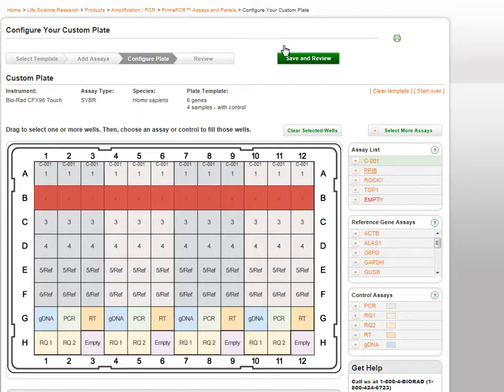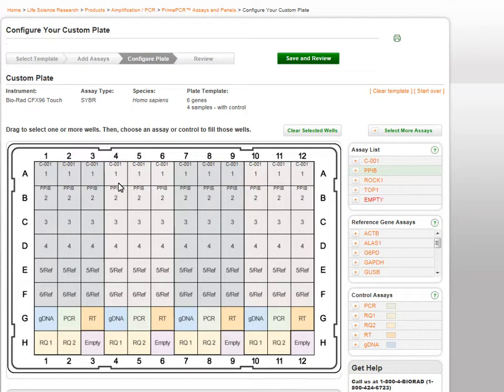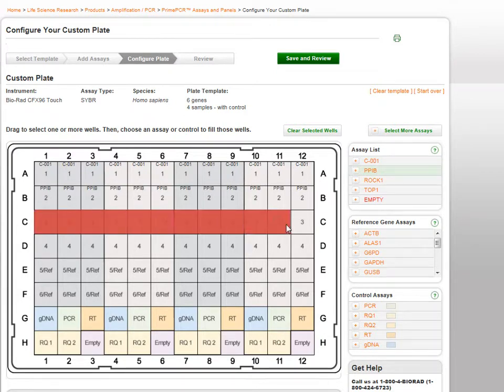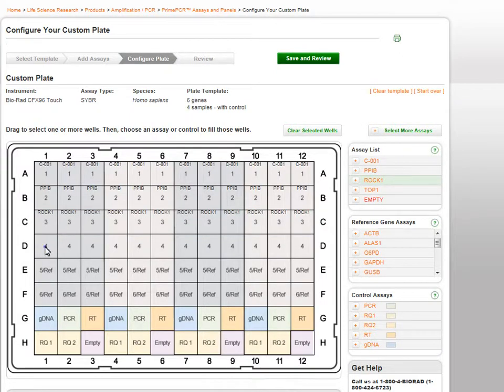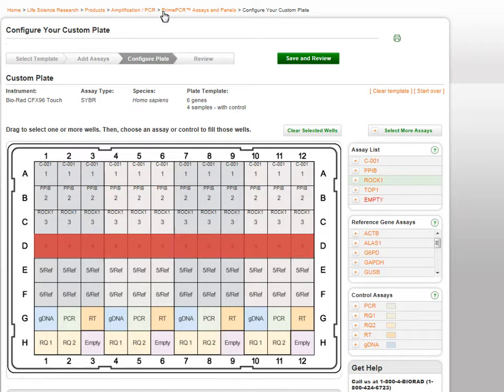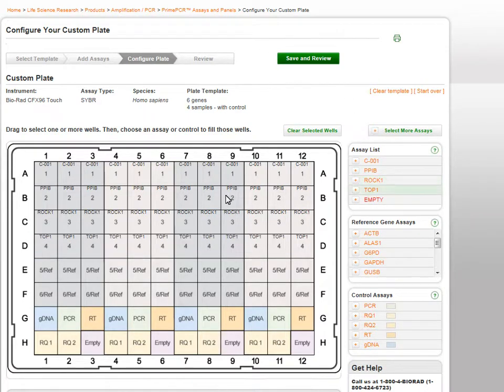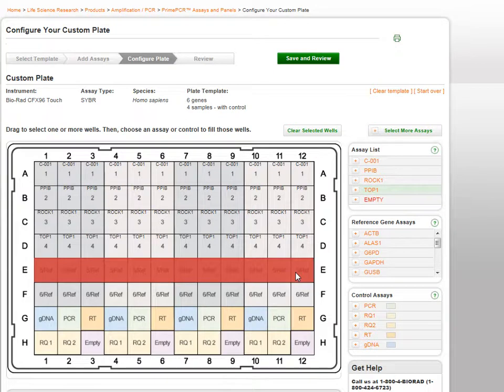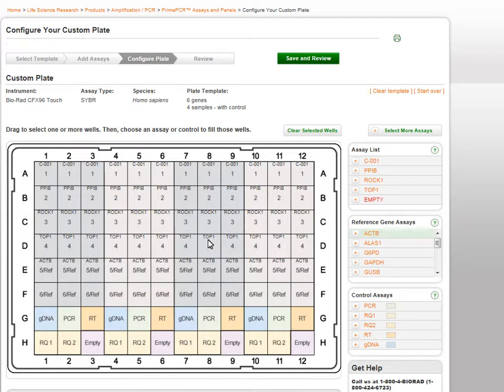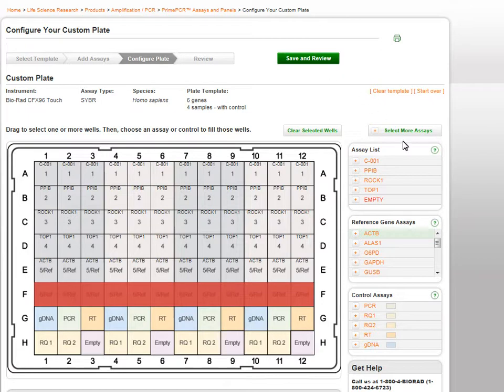Continue this process to complete your plate. Suggested reference genes are listed on the right-hand side along with experimental controls. It is important to note that control assays are not already on the plate and must be added manually.